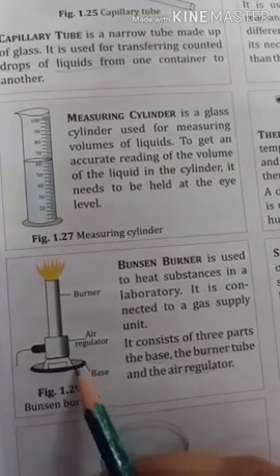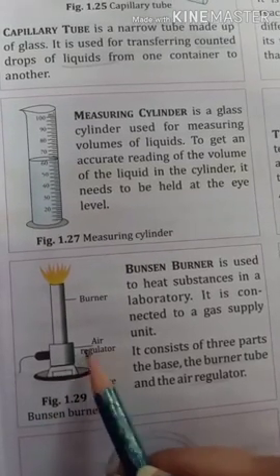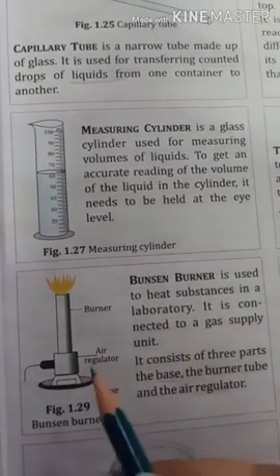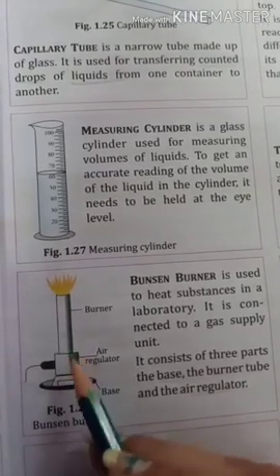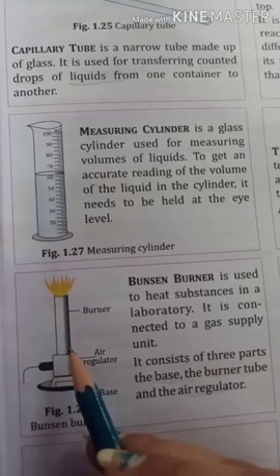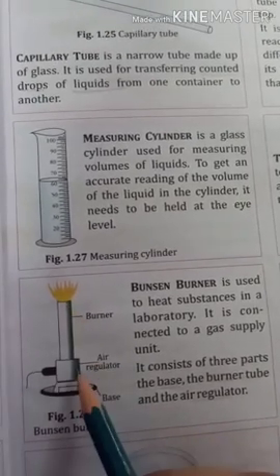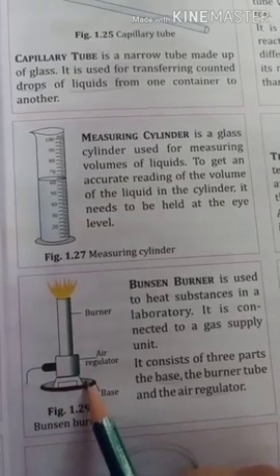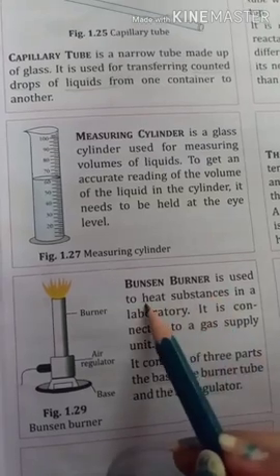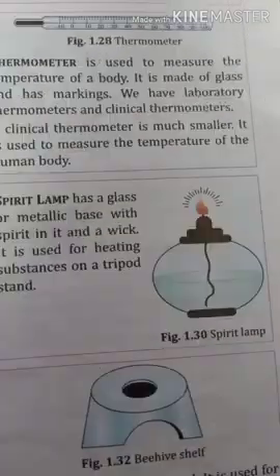So here we have the base of this Bunsen burner, then the air regulator. From this point we can change the amount of air accordingly, and the third part is the burner tube. So this is the burner tube, this is the air regulator, and this one is the base of the Bunsen burner. And a Bunsen burner is used to heat different substances in the laboratory.